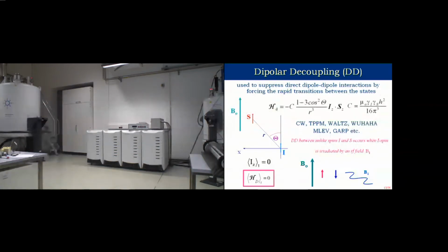So therefore, somehow we can remove these interactions. There are many methods which can remove these interactions, generating or locking one of the spins in a specific direction. The spin-spin interaction can change the Hamiltonian, and therefore the best way is to lock one of these precessing moments apart from the second one.